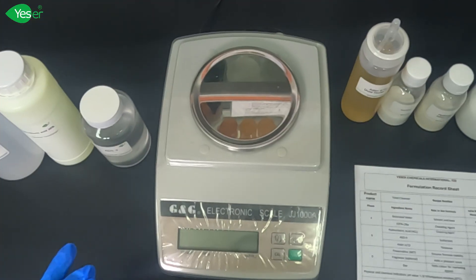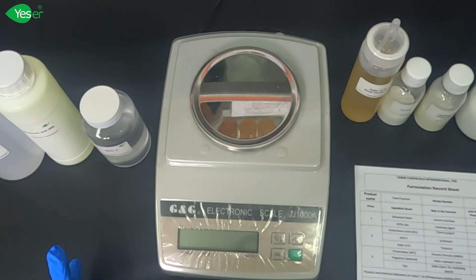Now let's see how xanthan gum, HPMC, salt, and Aslan 012 perform as thickeners in this formula.